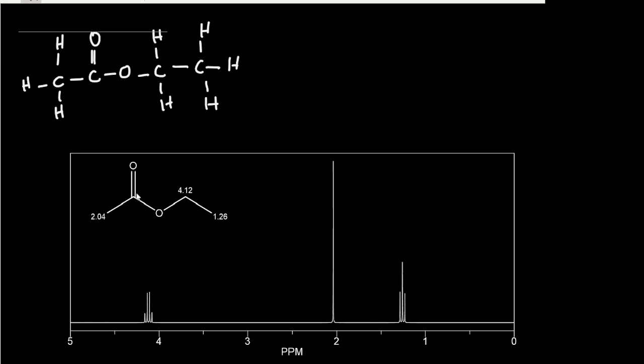Whenever you have to study a spectrum, you need to open the structure, and after that you have to number the carbon. You can number the carbon from left to right or right to left. It depends upon what you wish. So if you want to number in this way, most suitable, straight 1 2 3 4. The protons which are attached to the same carbon are in the same environment. Like the protons attached to carbon 1, we may name them as A type of protons.